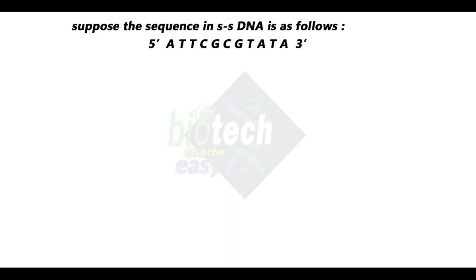Now we'll talk about what is the procedure after the chemical degradation, how we are going to find out the sequence.